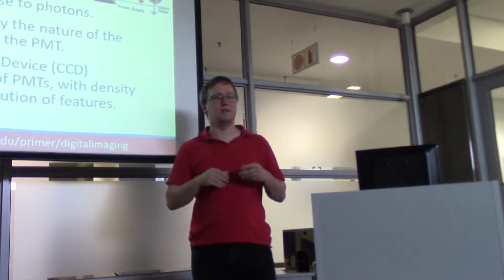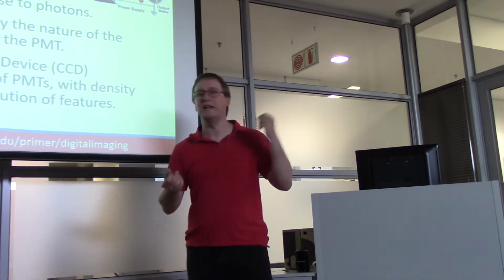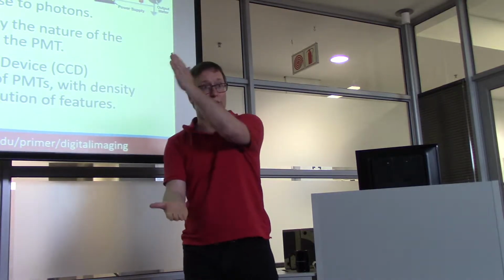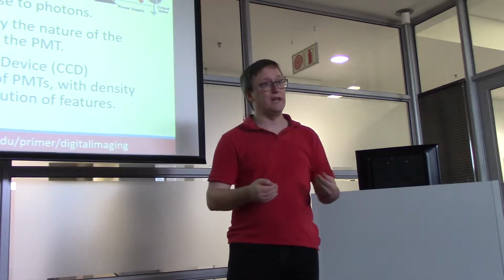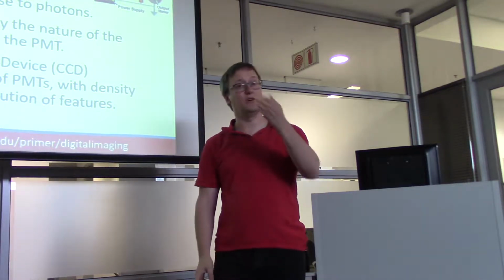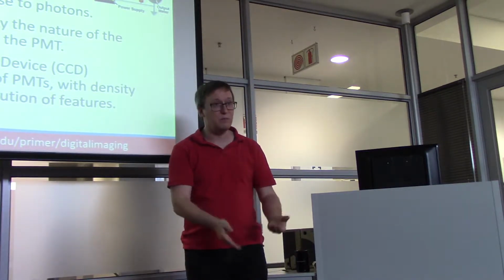So here we have an incoming photon at the left. A photon is a particle of what? Light. A particle of light. All right, and so the photon hitting this first electrode kicks loose a shower of electrons. Those electrons then pass to the next electrode, and their arrival at this next electrode causes an even bigger shower of electrons. That shower of electrons hits the next electrode, and boom, it's amplified again. So what we have is this huge step up in strength. What arrived was an individual photon. What was emitted is a shower of electrons. And by creating this shower of electrons, we create a current large enough for measurement. Okay, so a PMT is a way of turning light into a shower of electrons that can be measured as a current.